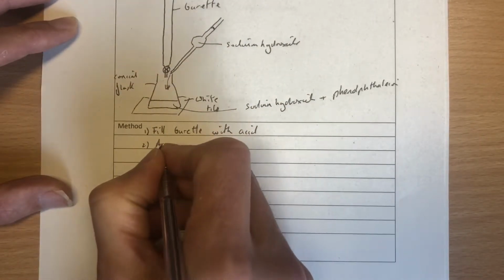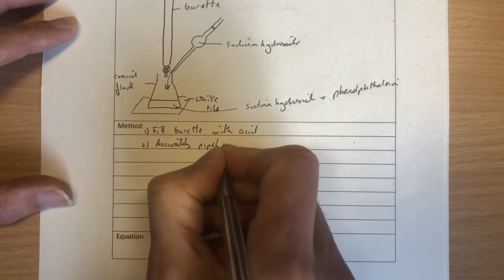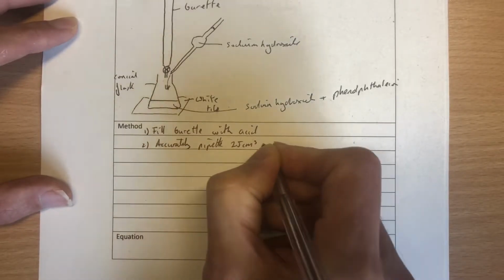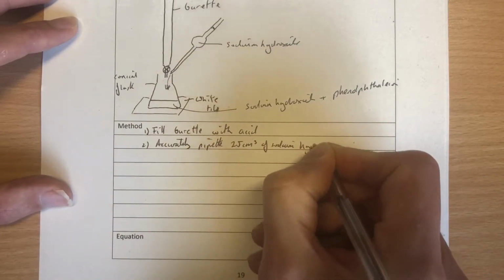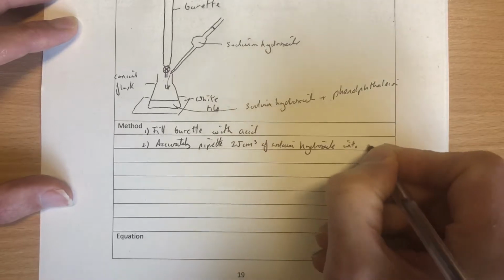We're going to accurately pipette 25 centimetre cubed of sodium hydroxide into the conical flask.